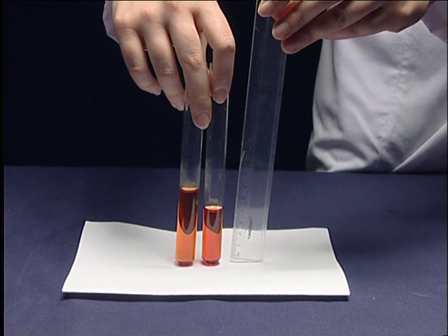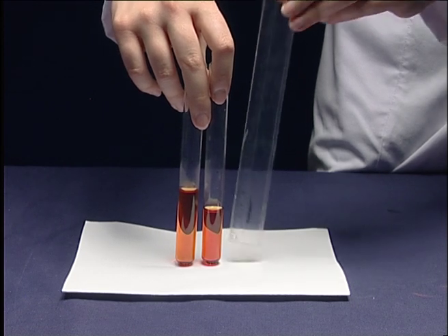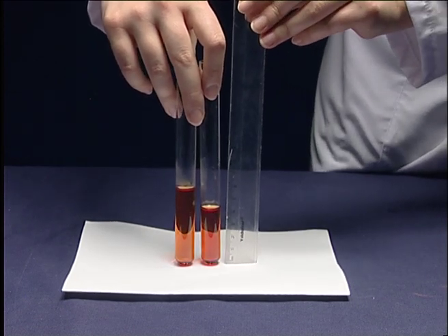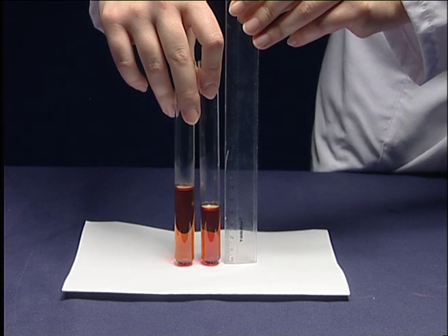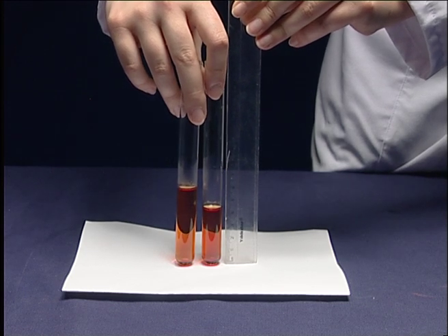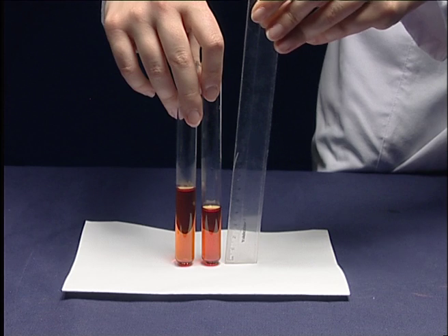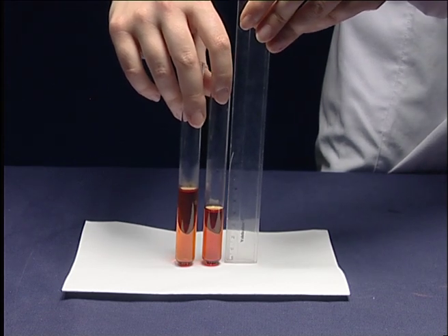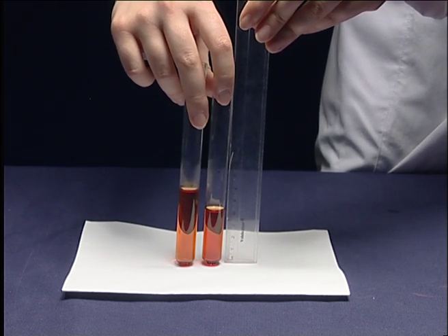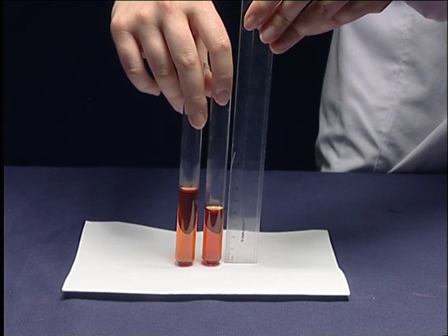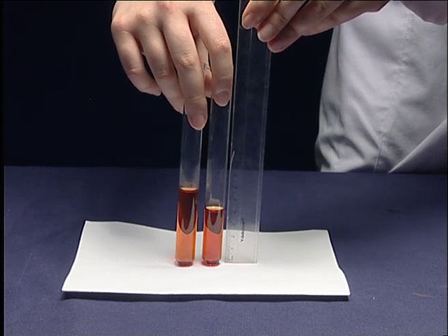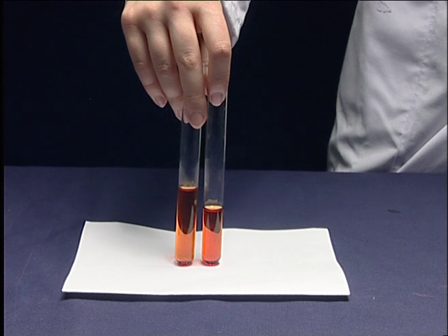Pour the solution from the standard test tube into other test tubes until the same color is observed. Then measure the height differences with the ruler and write the height differences in your report.